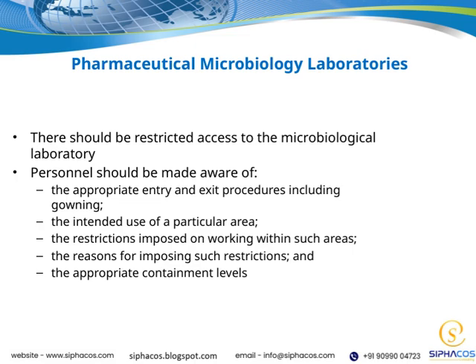It's also important to recognize that there are restrictions on working within these areas. These restrictions are in place for safety reasons and to protect the quality of microbiological testing. Understanding the reasons behind these restrictions helps reinforce compliance and awareness. Lastly, personnel should always be conscious of the appropriate containment levels required for different tasks. This ensures that the laboratory maintains the necessary biosafety standards to protect staff, the product, and the environment. All these points are vital to maintaining a controlled, safe, and compliant microbiology laboratory environment.